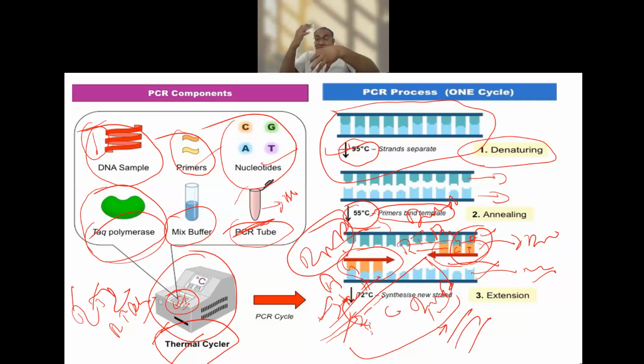Then the same again. First I have two. One DNA is turned into two DNA. The two will become four DNA. The four will become 16 DNA. So the fluid is going to get millions and millions of copies through cycles. You get the point here.